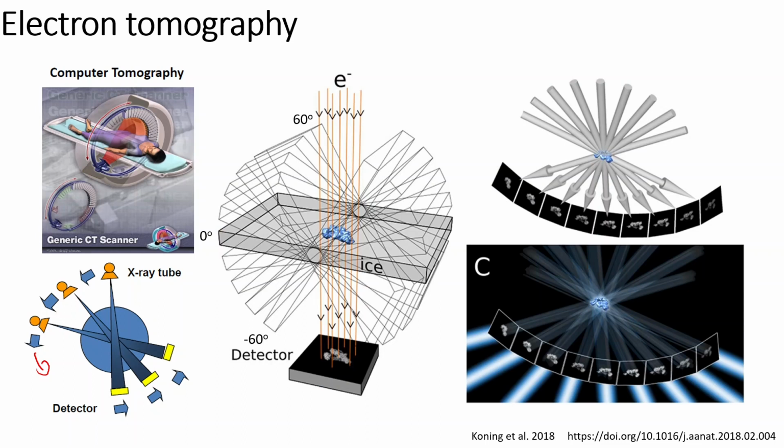The advantage of computer tomography is that it can rotate all the way around, 180 degrees, the patient and take a full so-called CT scan. We also have electron tomography, for which we obviously use an electron microscope. This tomography is analogous to computer tomography, but we are not using X-rays here, we are using electrons, and these electrons are irradiating our sample.